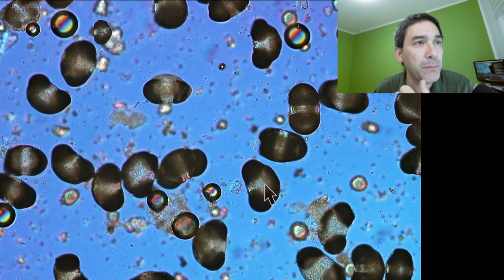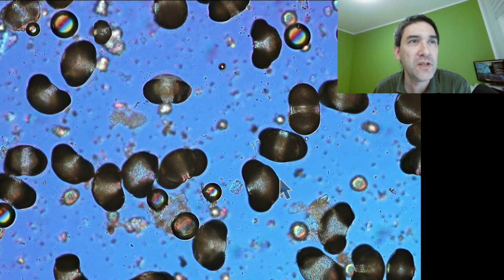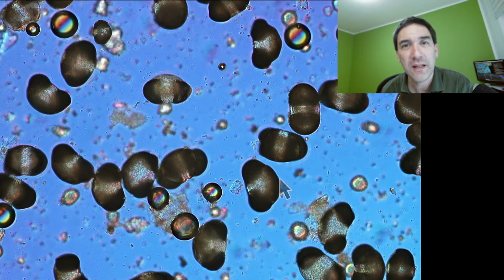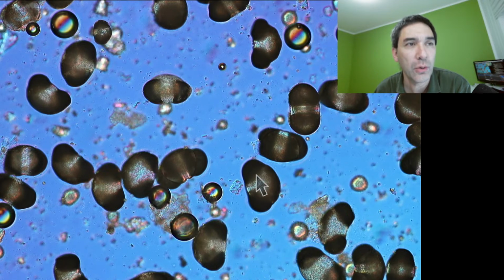So when pollen actually starts to germinate, it will start to form a tube growing out. This tube will grow, and it will then contain the sperm cells that will fertilize. I'm looking into the wrong camera, I just realized. Okay, so this is not because they have started to sprout, but that's actually their shape.